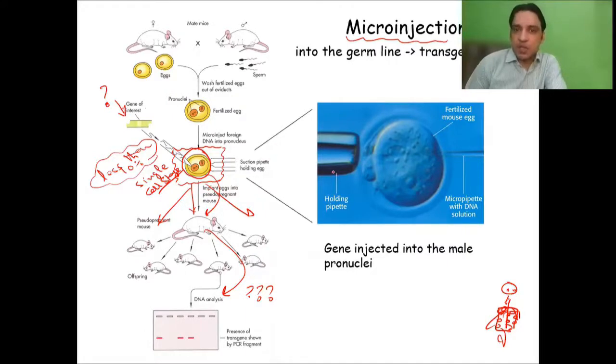This experiment was done with the help of a holding pipette, a pipette which is used to hold the zygote. Zygote is a comparatively bigger cell, so you can hold it. Usually it was held within the groove of that pipette here. But a very wonderful science, अच्छा साइंसदान वो है जो इसको pipette के बाहर भी help कर सकता है.